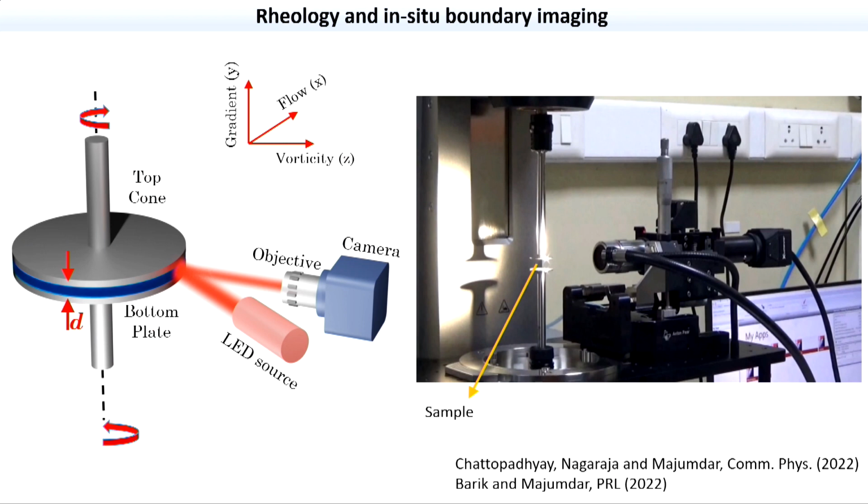So for the last maybe 5 minutes I'll spend on the experimental setup I told you about. Now we have been just mapping out stress versus strain data, but just to see what is going on in the sample. The sample, the particle being a hydrogel, is completely transparent, so we have to do some sophisticated imaging like fluorescent imaging to see anything.